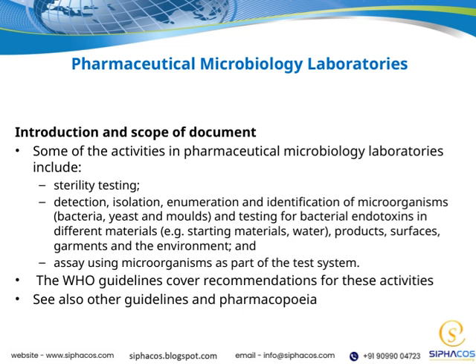They also test for bacterial endotoxins in various materials, including starting materials and water, as well as in the final products, surfaces, garments, and the environment. This comprehensive testing helps us understand contamination levels and microbial presence across the manufacturing process. Another key activity is performing assays that use microorganisms as part of the test system, which supports various quality control processes.